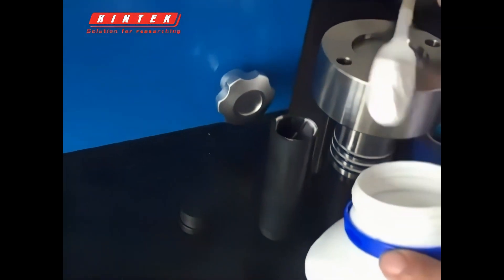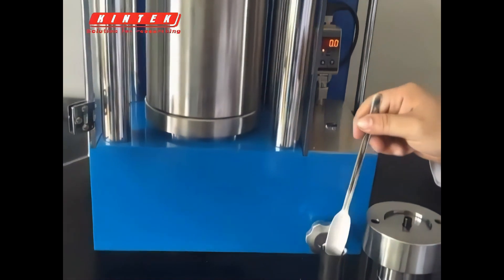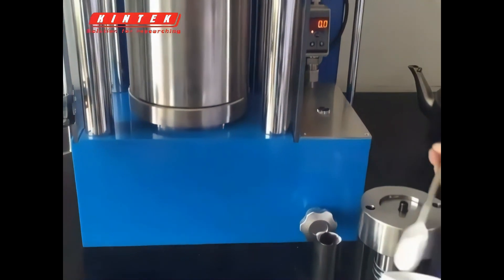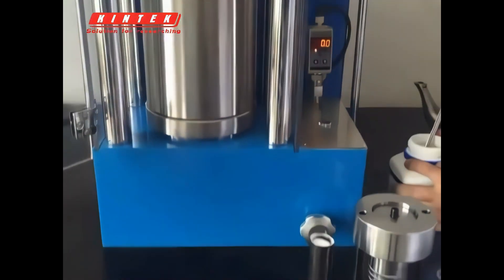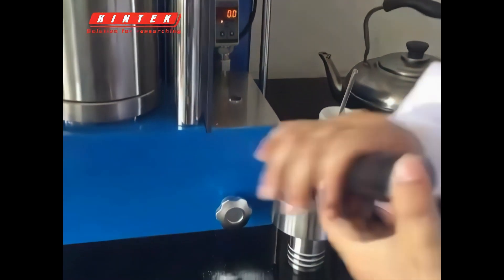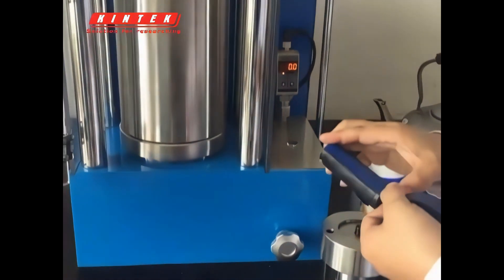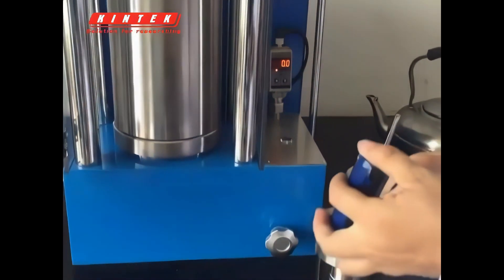We fill it spoon by spoon. Then we wrap it and seal it at both ends, so that the ends do not loosen when pressurized. Then wrap it with tape at both ends.